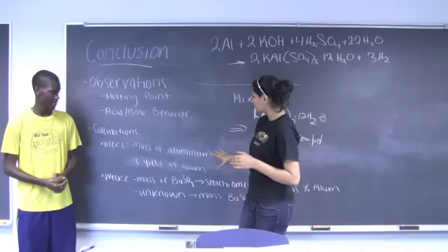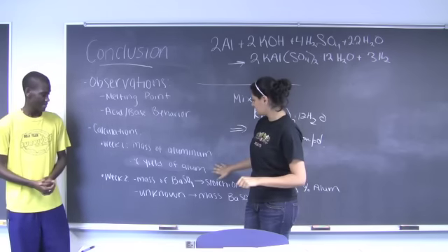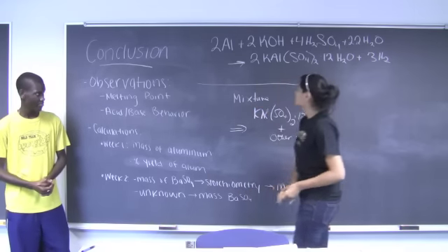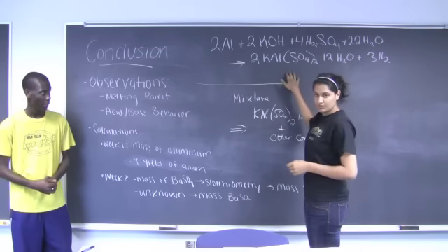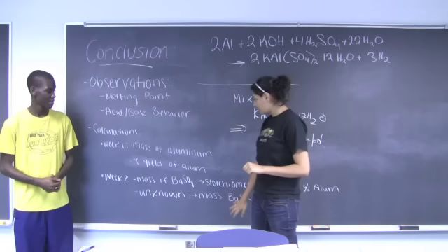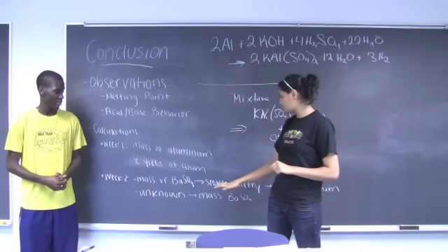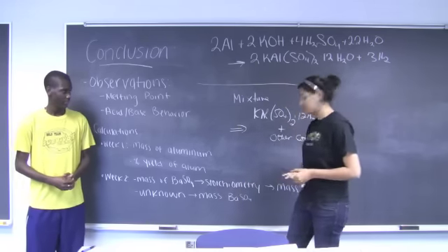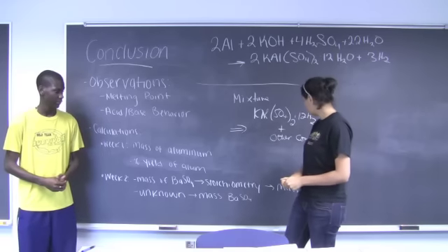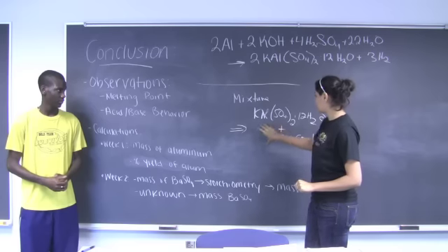So from the first week, what you should take is the mass of the aluminum. This is going to help you get the percent yield of the alum. When you're doing this, just make sure to use the overall balance equation, which is on the first page of your packet. However, when you do the second part, from week 2, you're going to take the mass of the barium sulfate from your unknown and use stoichiometry to determine the mass percent of the alum. When you do this part, you do not use the overall balance equation, you just use the equation of the mixture.